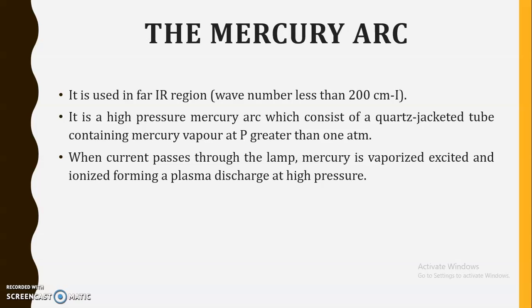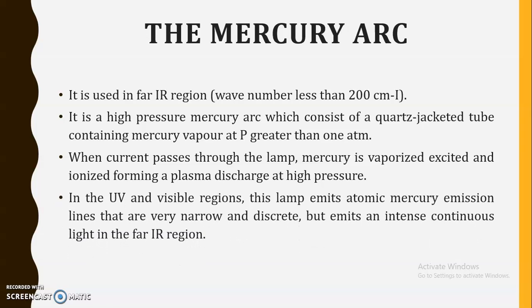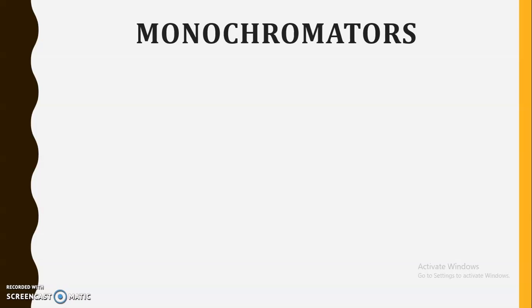When a current is passed through this lamp, the mercury is vaporized and excited, and it will be ionized, forming a plasma discharge at high pressure. In the UV and visible regions, this lamp emits atomic mercury emission lines that are very narrow and discrete, but it emits an intense continuous light in the far IR region. So these are the various radiation sources that are used in IR spectrophotometry.